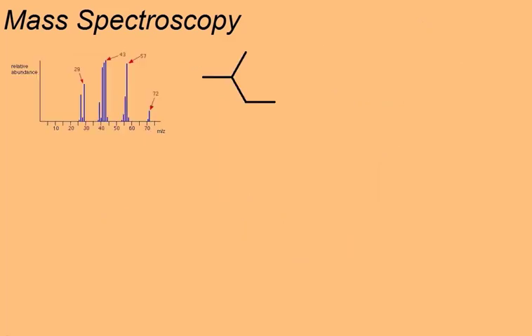If we look at the 2-methylbutane, again we can see our peaks according to the mass divided by the charge. Again, most of the peaks will be for a charge of just 1 plus, which is therefore giving us a value equal to the original mass for that fragment. As the molecule fragments, again we are showing preference to more stable cations as it breaks up.